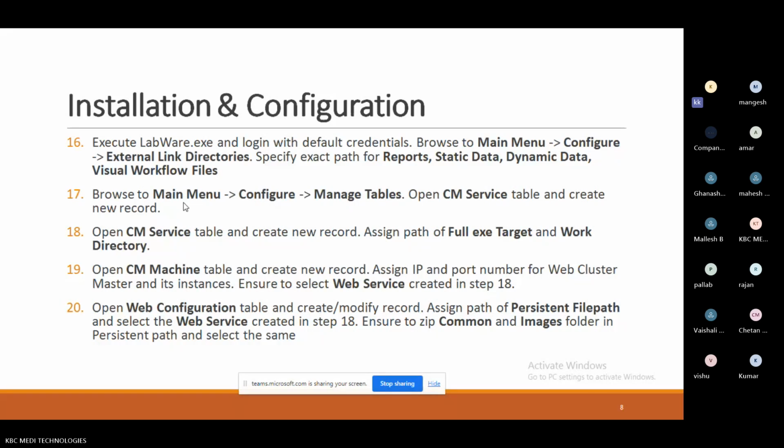That means I will give you one simple example. I have logged the batch. So every organization's sample login technique will be common. And followed by that, in some organizations, the sampling activity shall be performed by QC. In some organizations, sampling activities shall be performed by QA, IPQA. Okay. Raw material sampling will be done by a QC person, not from IPQA. We have such types of controls.